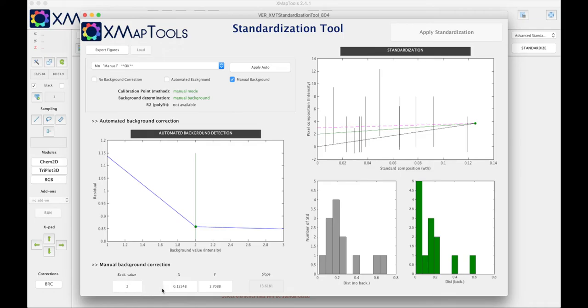Now you can edit either the intercept value or the coordinates of this calibration point. I'm going to change the background value to three in order to get something that is almost horizontal, which means that manganese will be zero in your map.